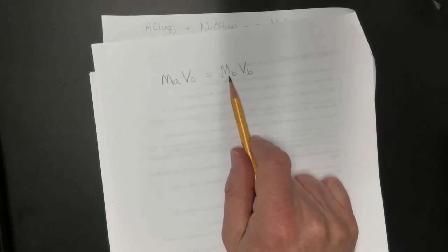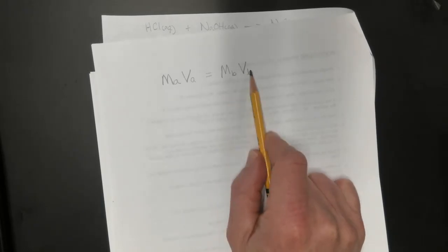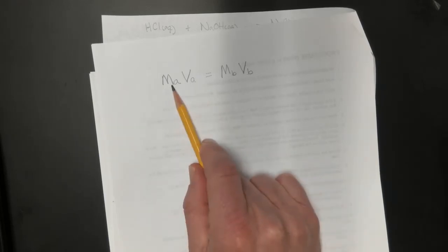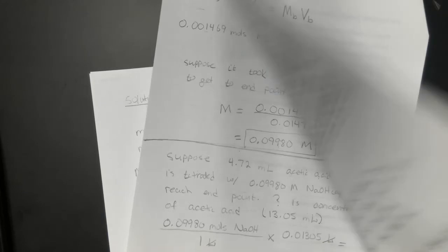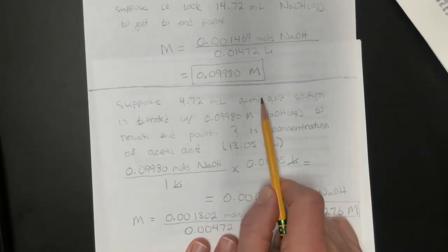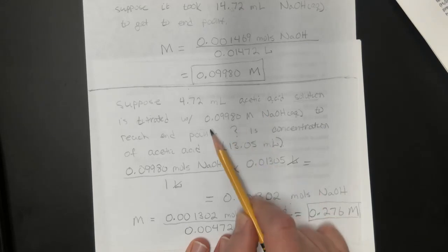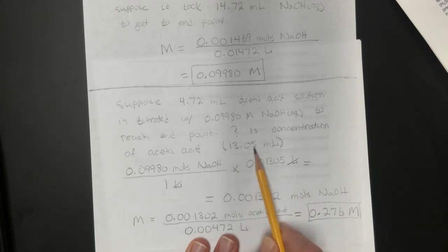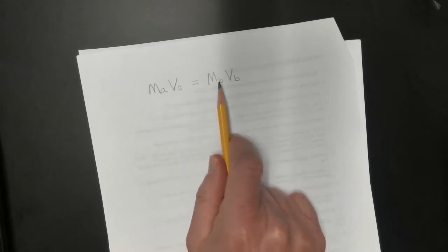If you know the concentration of the base, and you know the volume of the base, and you know the volume of the acid, then you can calculate the concentration of the acid. And if you look at this problem over here, I gave you the volume of the acid, so we have VA. I gave you the concentration of the base right here, so we know M sub B. And I gave you the volume of the base, 13.05. So you can put all those values into this equation and calculate the concentration of the acid.